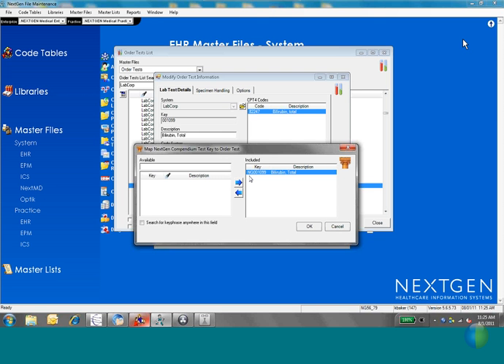The rest of you that don't have LabCorp, it won't be difficult to do, but I do recommend instead of going off of the key to go off of the description. So if you were needing to look up Bilirubin, you would just type in Bilirubin instead. So either way you do it, it's still going to be able to find the code that you need. It's just that LabCorp will have the exact code in here.